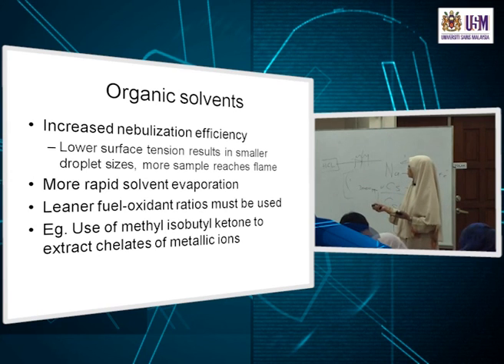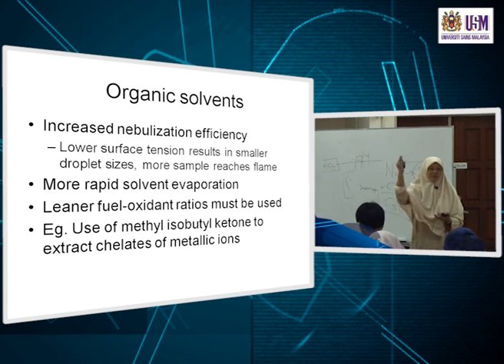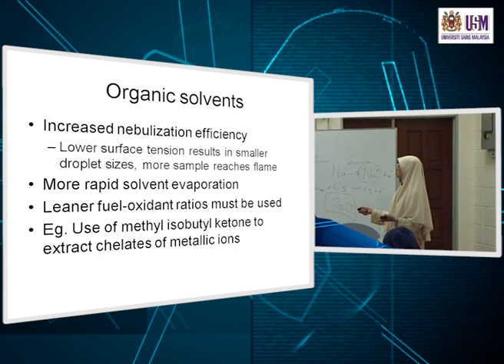So when you now have organic solvents, the predicted effect is usually that your absorbance will be higher. Why? With organic solvents, you have increased nebulization efficiency. Nebulization efficiency is just how many droplets you produce, okay? Organic solvents, ethanol, will lower the surface tension, therefore you get smaller droplets. Smaller droplet sizes means more get into the flame, because remember the bigger ones go into the drain. And more rapid evaporation.